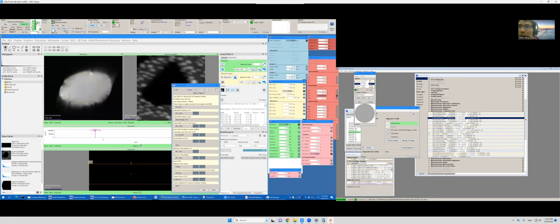So let's see. You will see now is the condition where the monochromator slit is charging so bad that you cannot see a clear edge of the MOA. So how to deal with this? So we click open and we click close. We keep trying to find a range where it will stabilize. Okay, so it looks like we need to open wider. Okay, now the edge is very clear. So now it's a good condition.